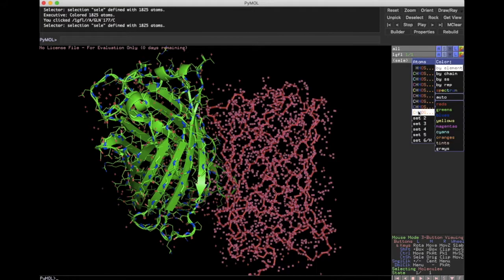And the international rules or standard around coloring atoms is that carbon is generally a charcoal or a black, hydrogen is white, nitrogen is blue, oxygen is red, and sulfur is typically yellow. All right, and you can see in here these aren't really adhered to, and the closest, I guess, is maybe the top one here, except the carbon, for whatever reason, isn't introduced, okay?